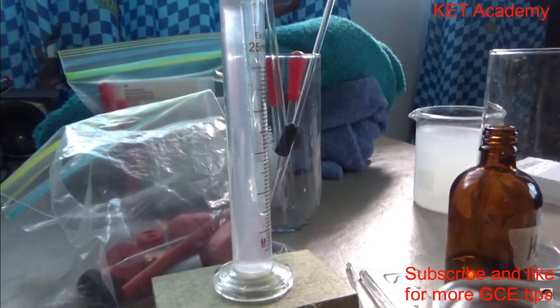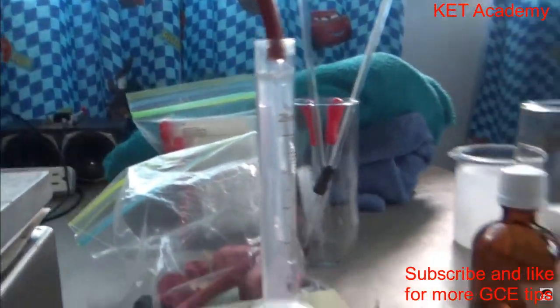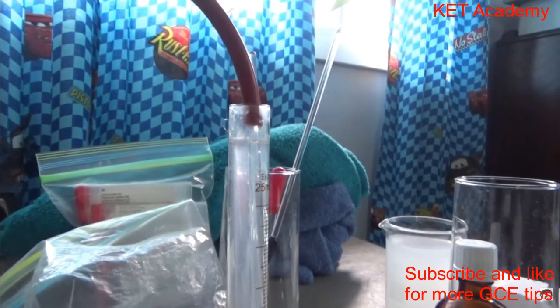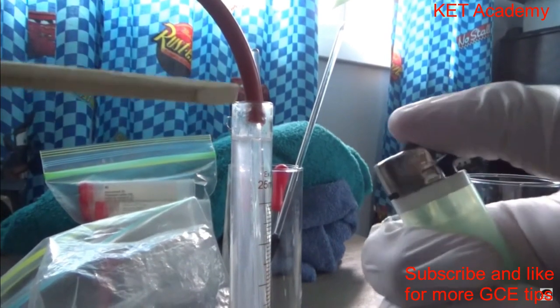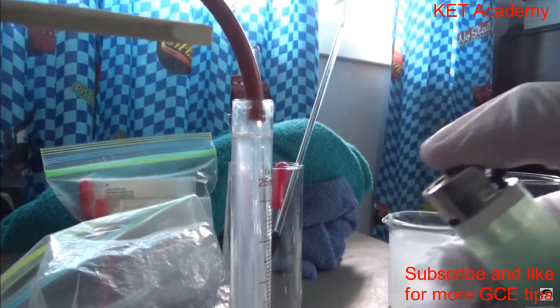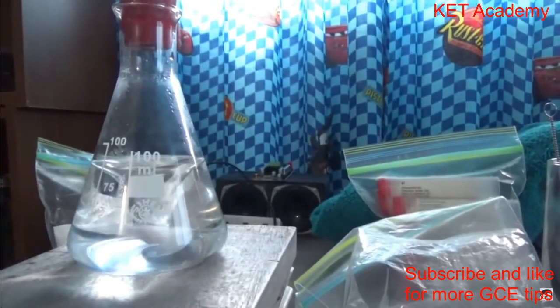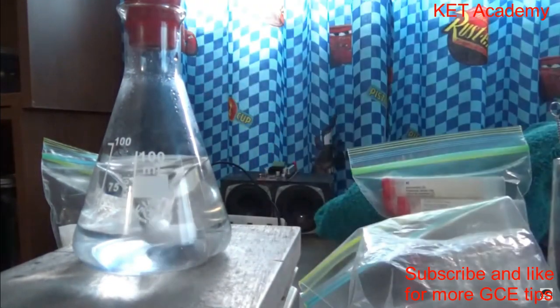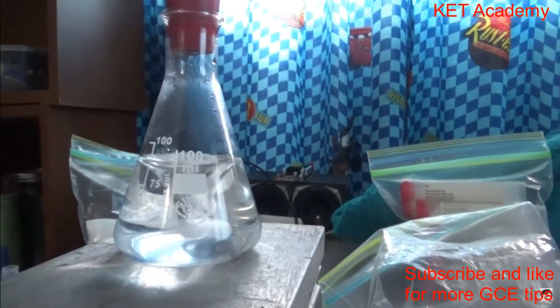Note to self, do not use this long of a tube. I actually think it is getting slightly milkier. I don't know if you can tell, but just in case, I'm going to perform another test, which you may have heard of before. I'm going to light this on fire, and I'll stick this above there. If it is carbon dioxide that's being formed and not some other gas, it should put this out. Okay.